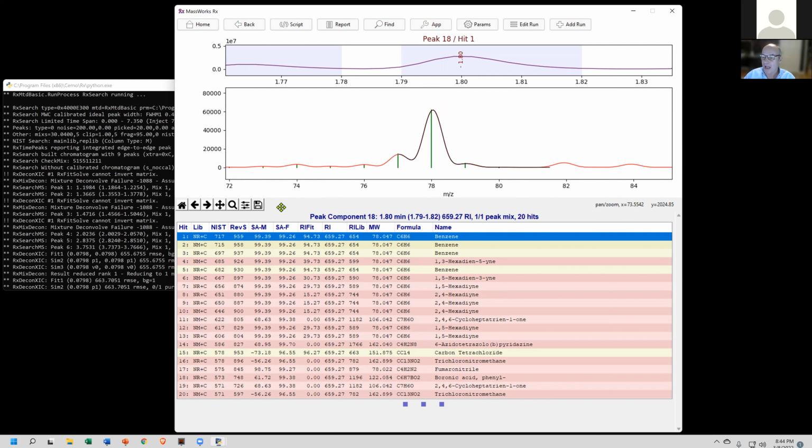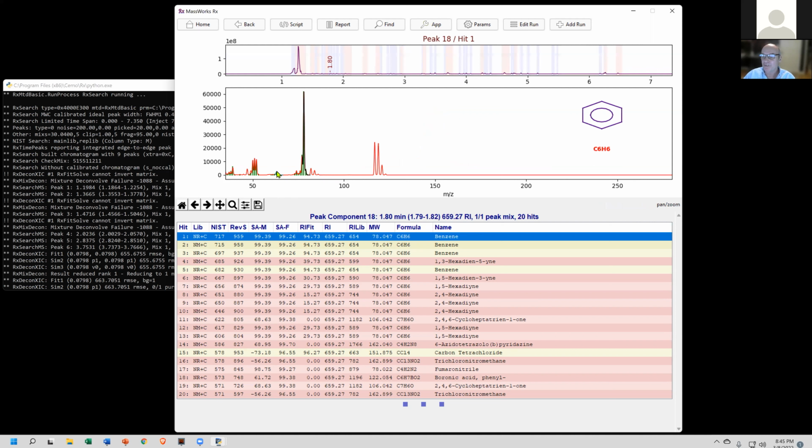This is the molecular ion for benzene at around 78, and you can see the overlay of the spectral accuracy, which gives us the formula identification at 99.39% spectral accuracy, within 30 millidaltons. So we know that's correct. But if we look at the whole spectrum, what you'll see is that these peaks here are not explained by the match. These peaks aren't explained by the match, and they're really significant. And this little peak over here is not. So it's likely a mixture.